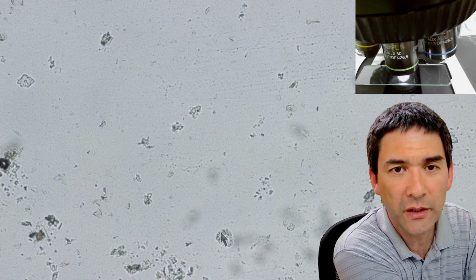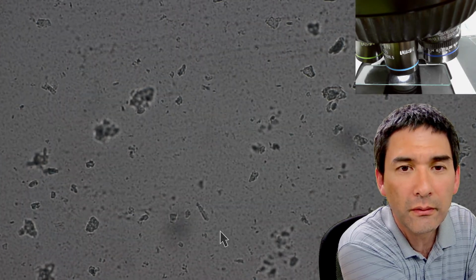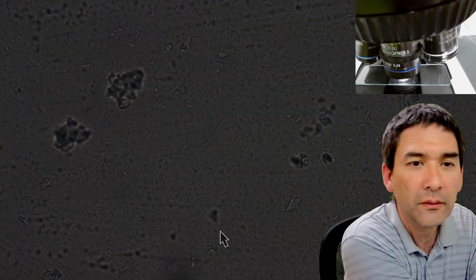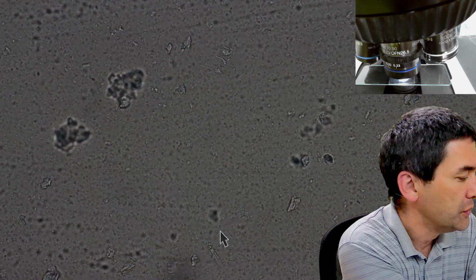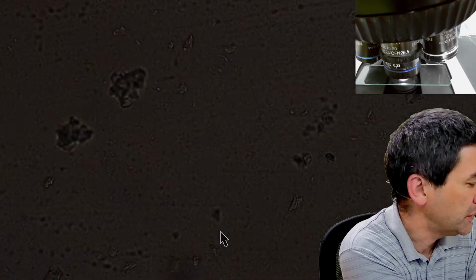I would assume that maybe there are lots of clusters present. But maybe. Let's go up again. So let's ignore the clusters, but let's try to put DIC in. Maybe the DIC makes it a little bit better to see.